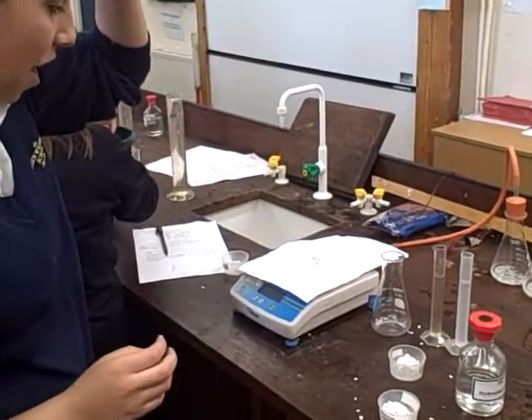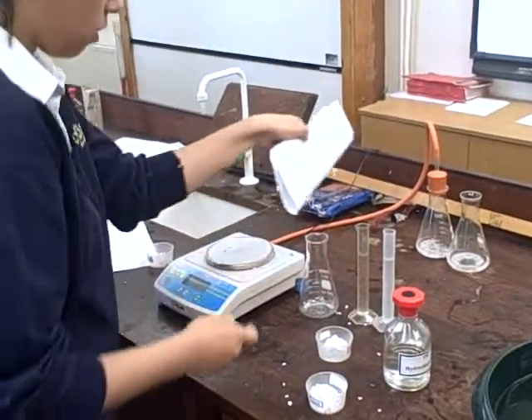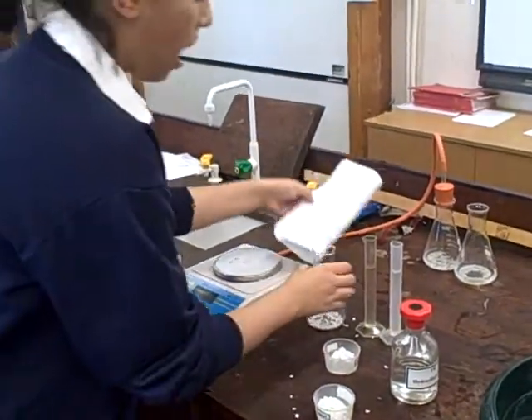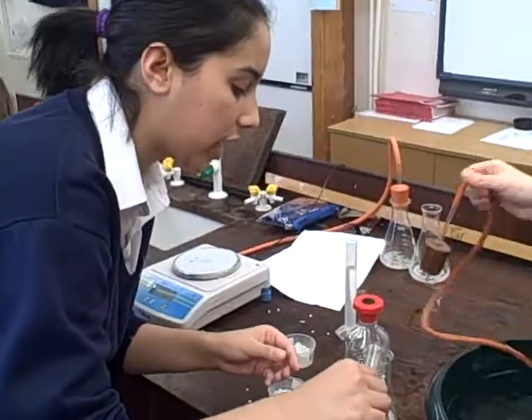Now the last time we were here, we dropped a piece of paper and measured that to be about a gram. And then we're going to add 50 millilitres of hydrochloric acid.